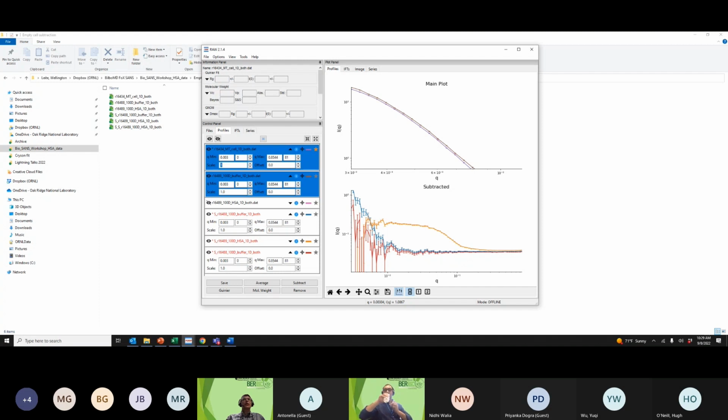normalizations. So it's something that's within the expected uncertainties that you can have in the normalization process. So that's why you have a very good physical reason here for applying small scale factors. If it's off a lot, then that would be a concern. But I think you had a few percent as a scale factor, 0.5. So that can commonly happen. I just thought I'd point that out because it's very significant when you look at this. You can see this if you have a little bit of experience. You can see what's happening here.